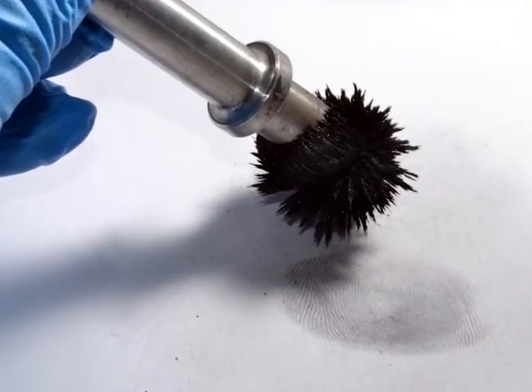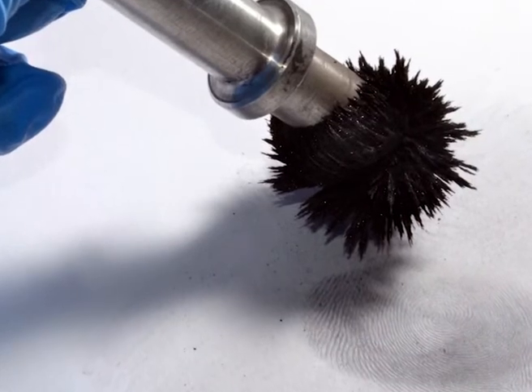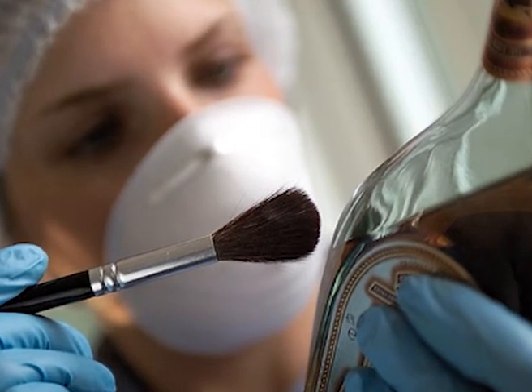Now, dear students, let us conclude this lecture. Ninhydrin is one of the most suitable reagents for revealing latent fingerprints on absorbent surfaces like paper, cardboard, raw wood and plasterboard. It is effective in visualizing both the fresh and the old prints. Its handling requires only a meager degree of skill and experience. It poses no occupational hazards, provided some simple safety precautions like using gloves, splash-proof goggles and fume cupboard are observed.